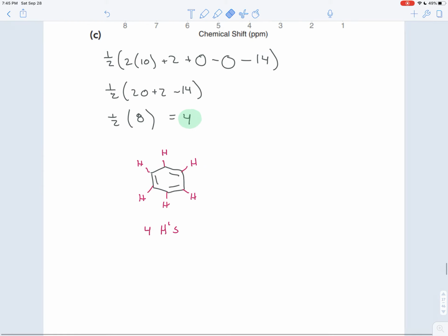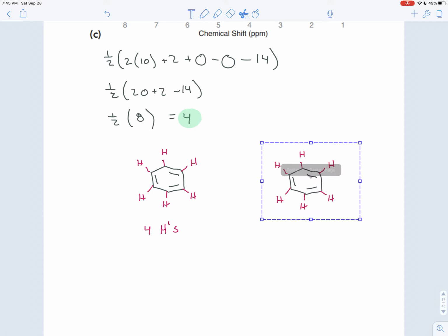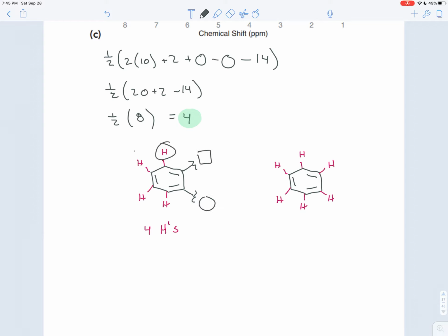So for the sake of comparison, imagine I were to take those 2 hydrogens off, and you'd have your branches coming off of there. In that case, if this is one type of branch and this is a different one, all of these hydrogens are in different electronic environments.